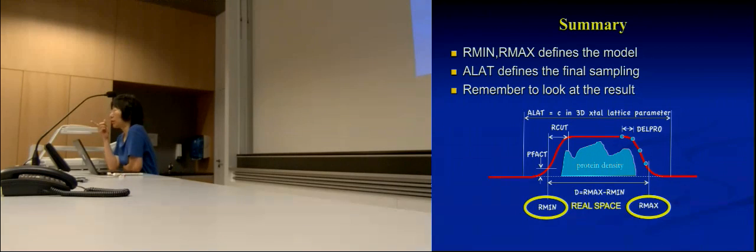But I think I looked at the interface yesterday. It reduces down to what I just said here, and you also added the bin size, and I think the bin size can be taken off as well, defaulted to some value, because that's only an initial guess. I did a few tests on that. If you change the bin size, it doesn't actually change your data if you have enough data in there to use a smaller bin size. So that can probably be estimated from your data as well. Yeah.